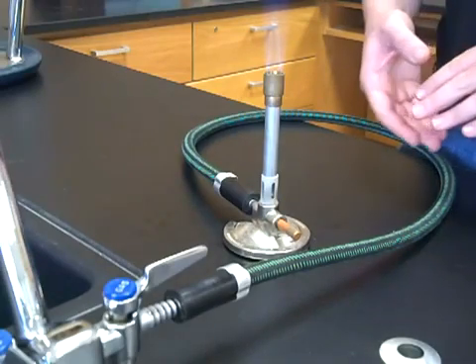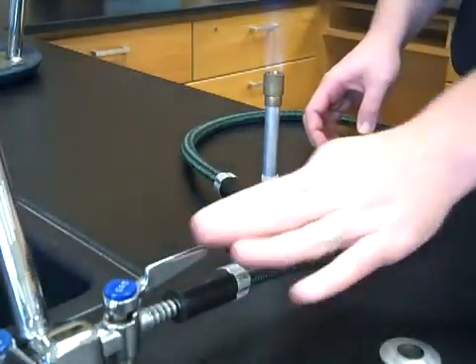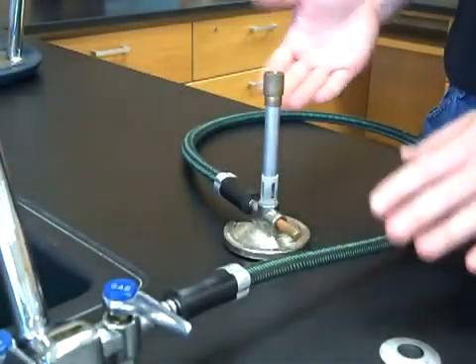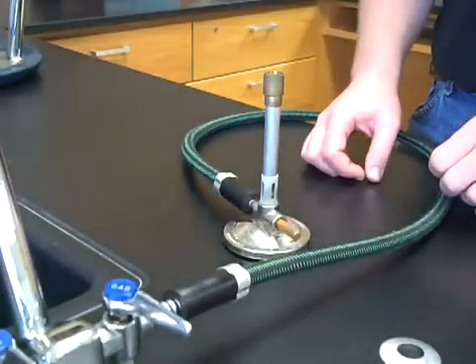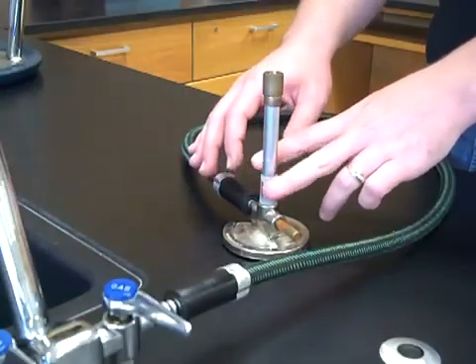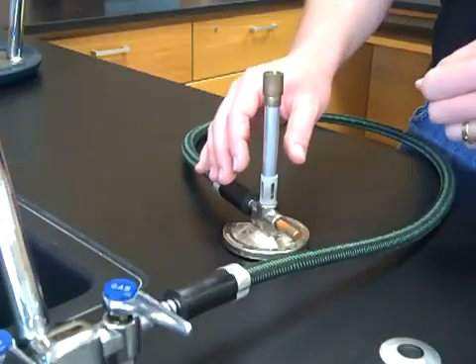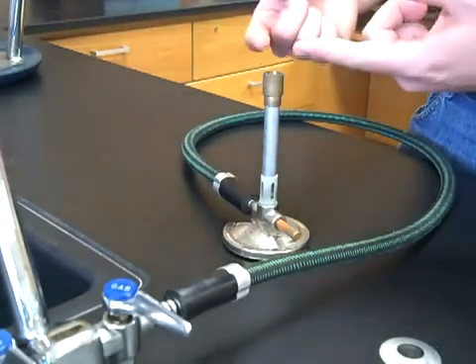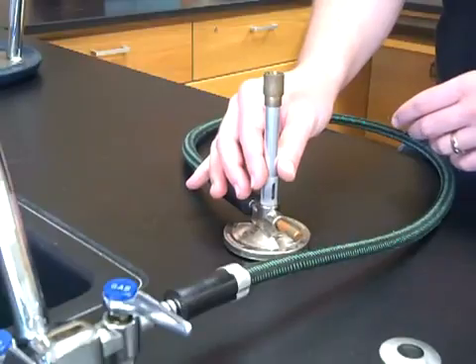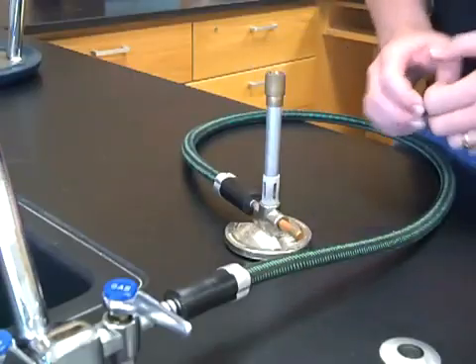When you're finished with the Bunsen burner, just turn it off at the main gas valve. You don't need to close the air vents or the needle valve — just cut the main gas supply off at the desk. The flame will go out, and then let the Bunsen burner cool down before putting it away. The base, needle valve, air vents, and even the barrel itself are generally safe to touch, as combustion doesn't take place until after the gas leaves the barrel. Use caution, however, if you've been using the Bunsen burner for extended periods of time.